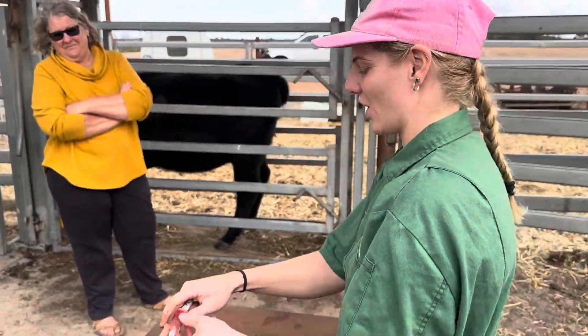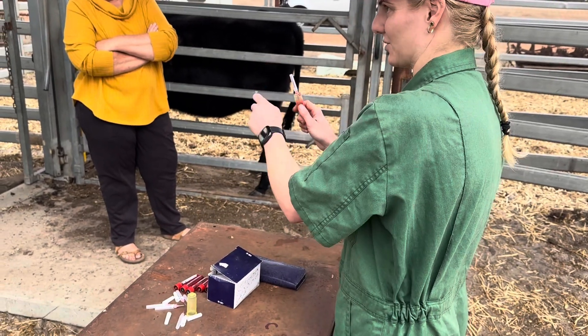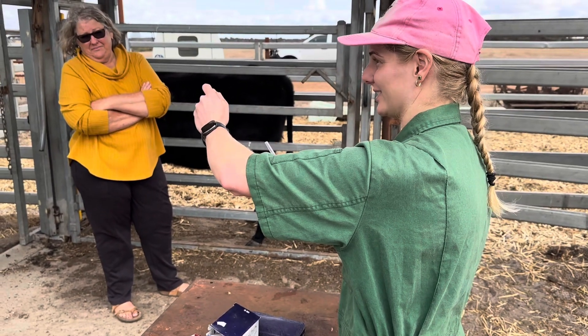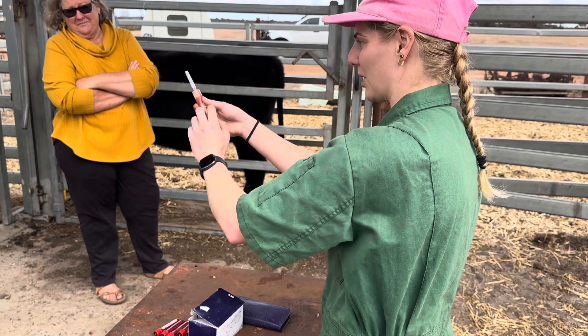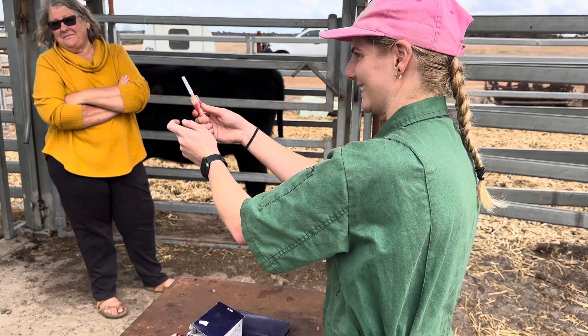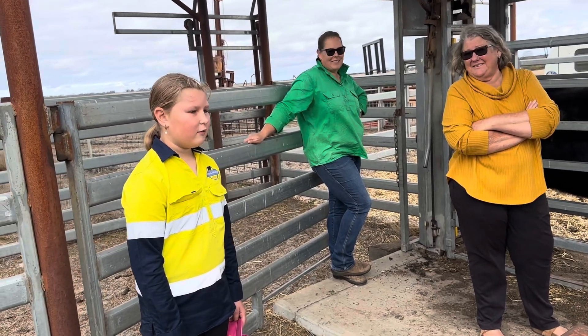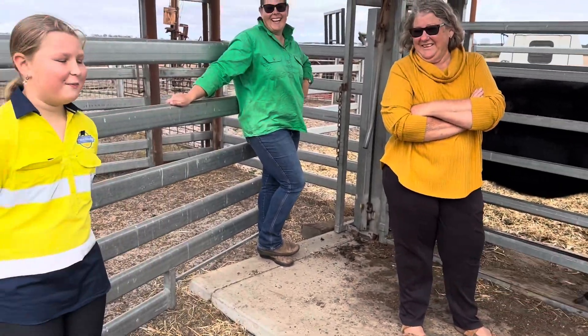So we're going to hold it close to it, just so we're ready when we get it into the right spot. We're going to lift the tail, find the two processes, know where we're going to go, remove the lid of the syringe, pop it in, pop the back container on, and then the second end of the needle punctures the container. Nice. Legend. Spot on.